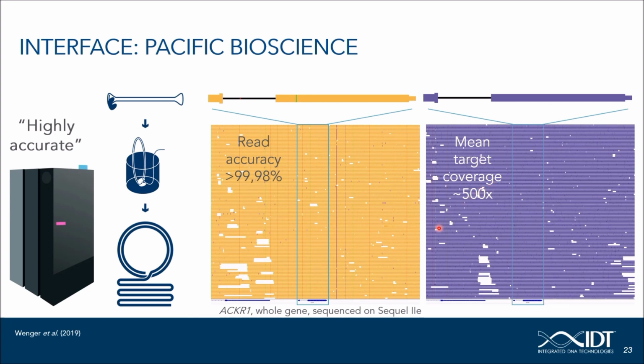Pacific Biosciences sequencing, our second platform, shares the principle of sequencing by synthesis with NGS approaches. However, in PacBio's case, this is done in real time and for single molecules as compared to sequencing cycles and cluster sequencing in NGS.